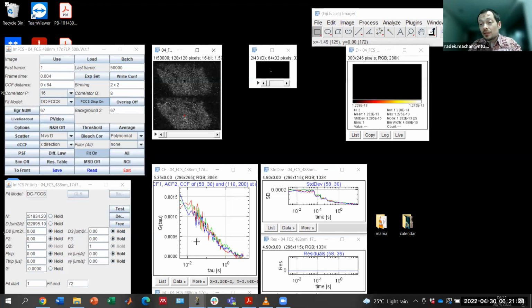The reason is that the results of the fit of the previous pixels are used as the starting values when fitting the next pixel, which works very well if the fits converge and all the pixels are similar, but it might cause problems when we come across some pixel where there's no correlation.